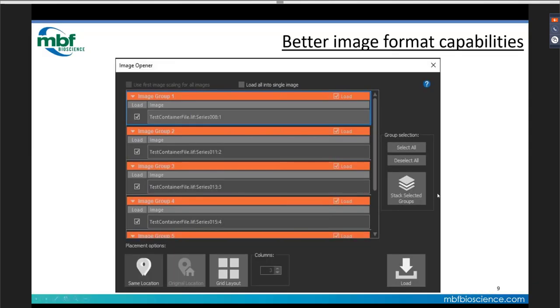The new image opener dialogue is a major improvement for container files like LIF or CZI. Previously you could only open one image at a time. Now you can drag and drop a container file and see every single file within it, then choose to open one, a few, or all — in the same location stacked on top of each other, in their original acquired location, or in a grid layout.